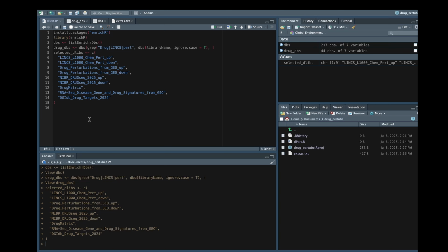Now, the next thing to do is to define your list of upregulated and downregulated genes. So this will vary depending on which systems you're working with. But for the purposes of this demonstration, I had already curated a list of genes that I routinely work with in our laboratory, and I know that they are upregulated and they are downregulated in our systems.